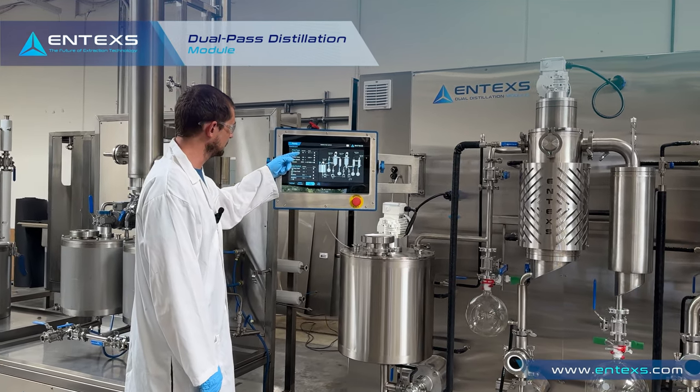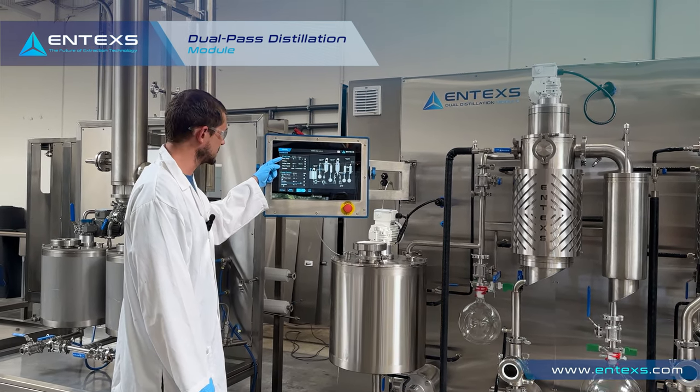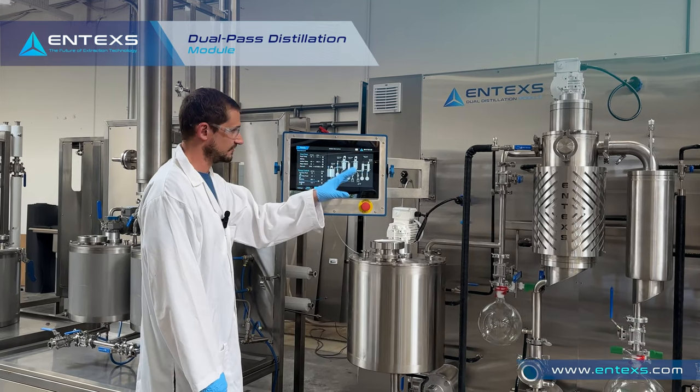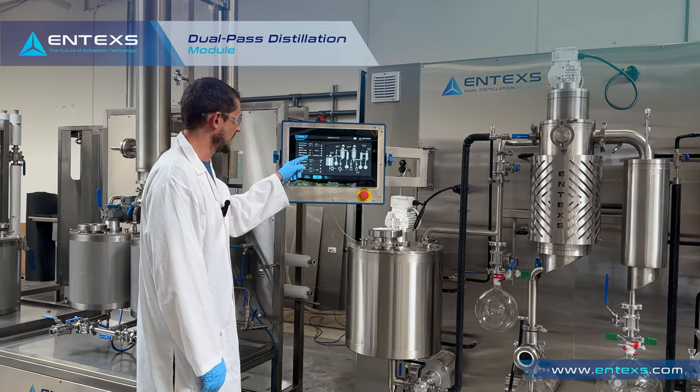Here you have set points for all the various parameters of the first pass. We have our feed temperature, wipe mix, our jacket temperature for the first stage wiped film, our wiper speed, and our vacuum.